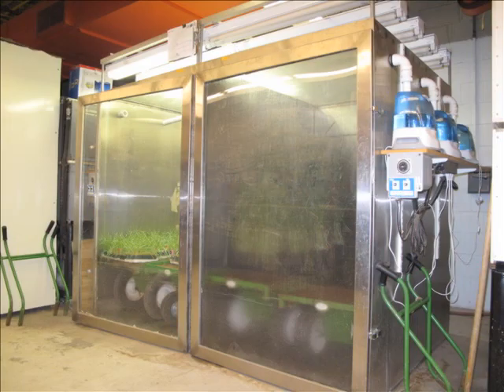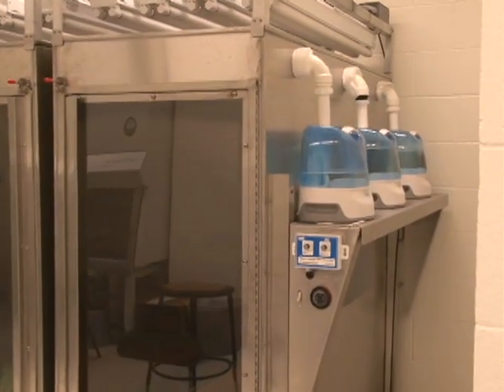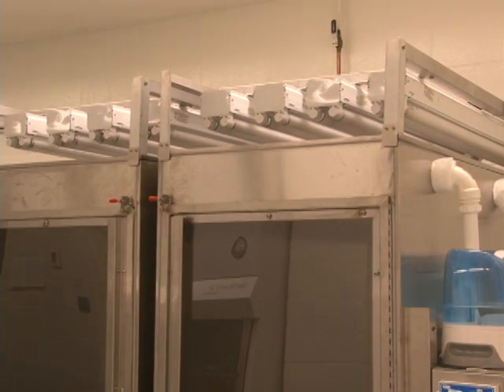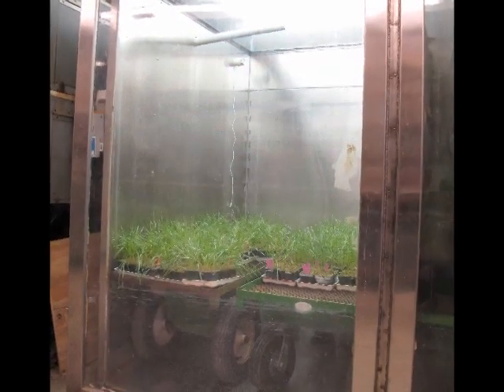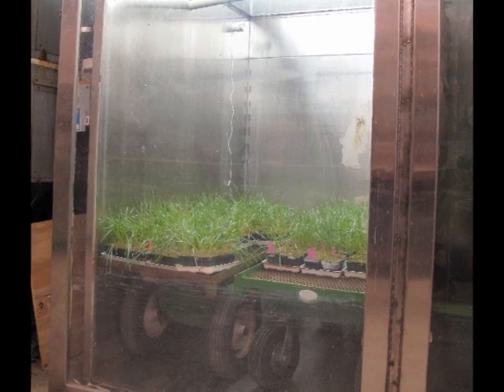If you have several plants that you would like to place into a dew chamber, or if you would like to control the environment, you can use an automatic dew chamber. We have these dew chambers where humidifiers are attached to the side providing moisture. Since these dew chambers are inside, fluorescent light bulbs are attached to the top, and during the 12 to 14 hour dew chamber period, the lights are turned on for the last 3 to 4 hours.